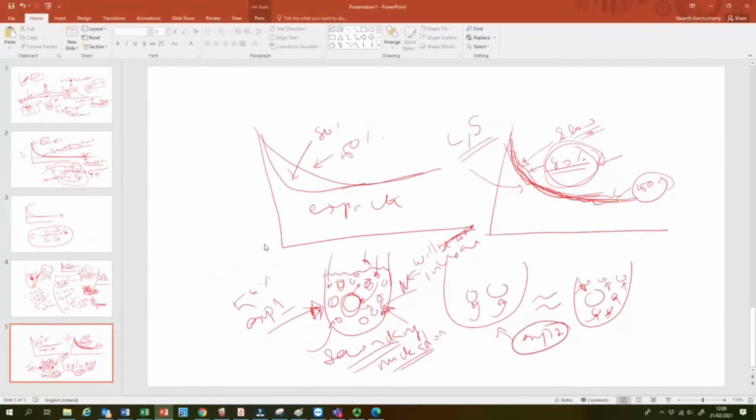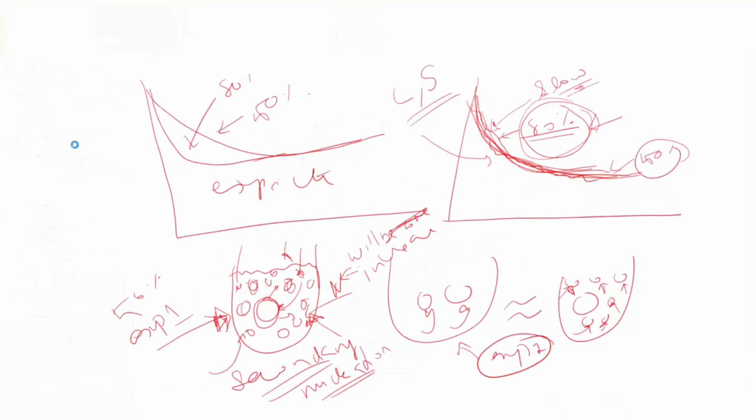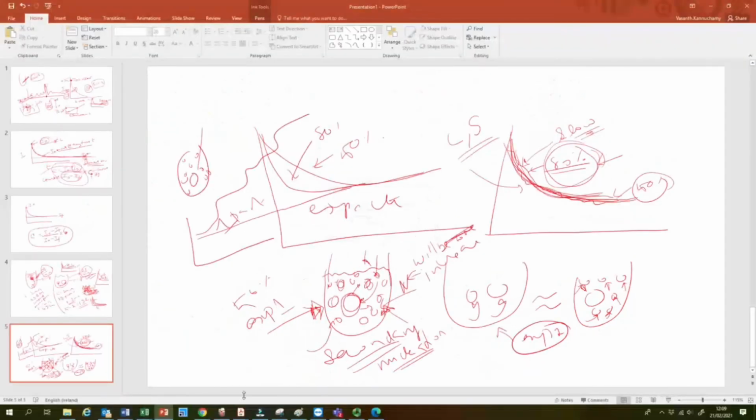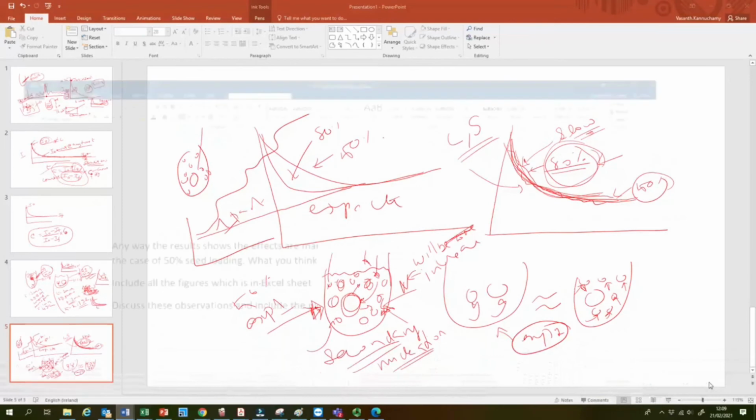Say, imagine if you started your experiment with only one particle, when you put the FBRM, the number of particle counts should be constant throughout your experiment. It should be equal to one particle. But if something happened, some new crystals formed due to nucleation, then this number will go up something like that. So that's what we observed in experiment 1. So let's go back to experiment 1.